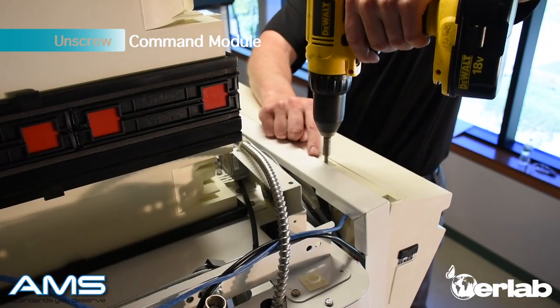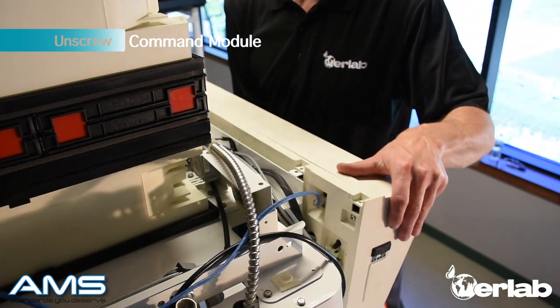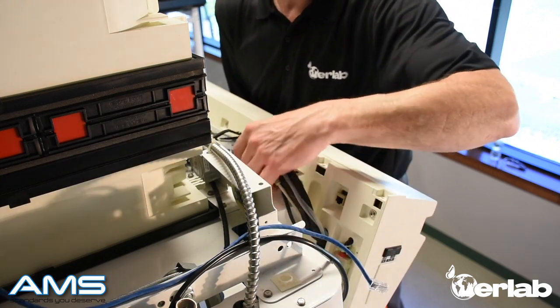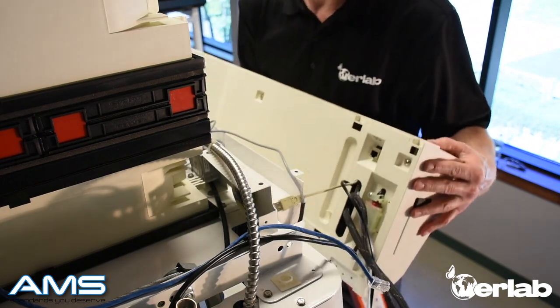Take your power drill and unhook the trim guard off the command module. Once you've done so, support the command module and pull it forward so you can access the ethernet cable and disconnect that. Now pull all your wires free so you know they're not hooked on the hood, and remove the command module.